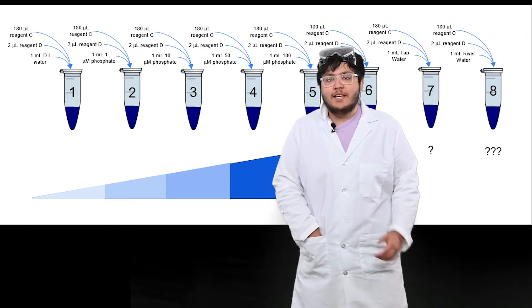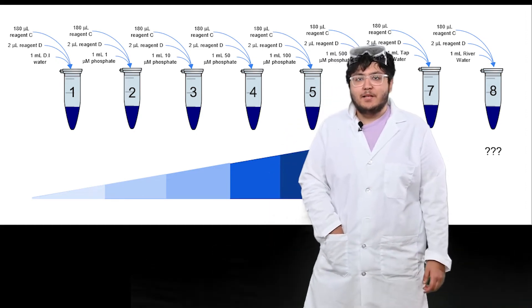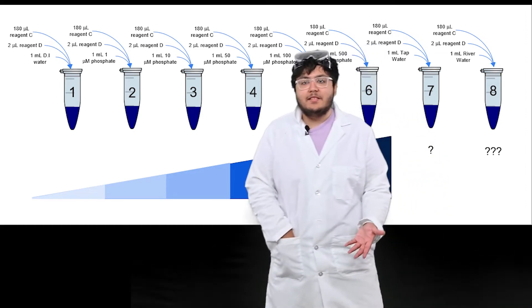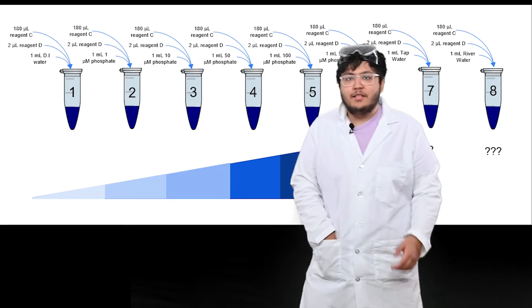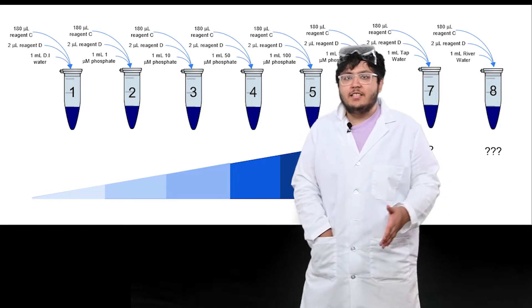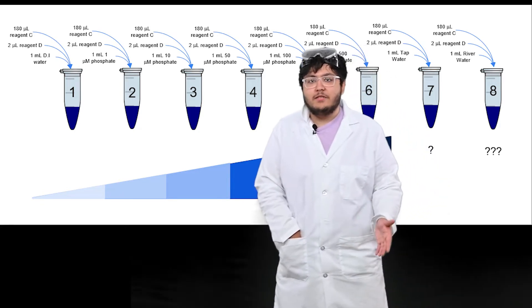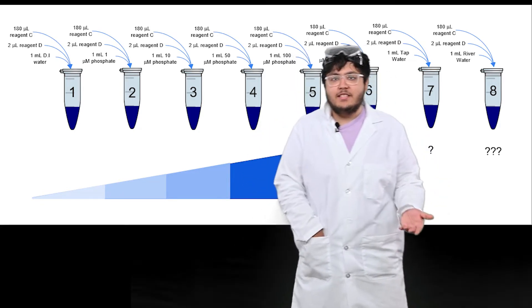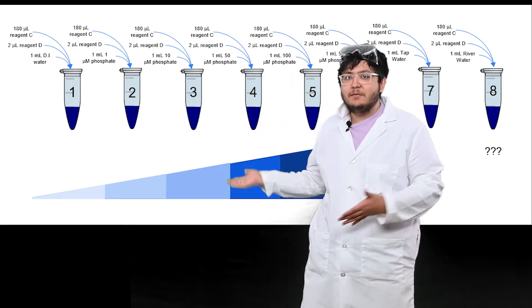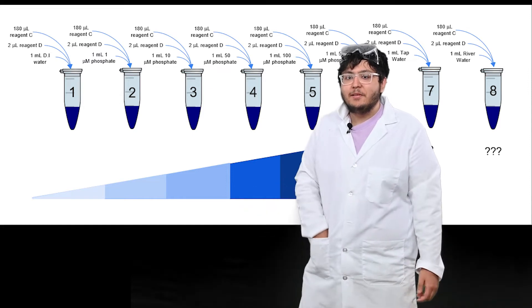Now that we have all our reagents, we can set up this experiment. All we have to do is add two microliters of reagent D and 180 microliters of reagent C into each of the tubes shown.